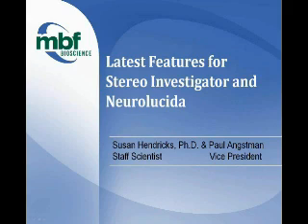We're thrilled to preview some of the great aspects that will be a part of version 10 for our flagship software products. You may have seen some of these if you stopped by our booth at the Society for Neuroscience conference, but they've got a bit more polished now and are just about ready for you to use.